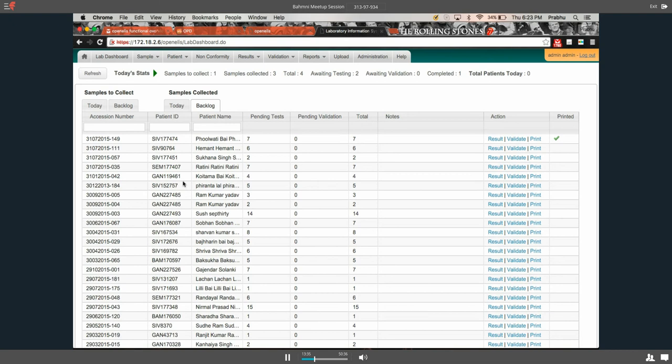That is really the relevant one, because that's the perception for the patient. Once they've given their sample, we have this idea that within 3 hours they'll get their results, or at least the results will be available to the doctor to see for follow-up, and then allow them to do any prescriptions and finally leave. So that's why the 3-hour time.